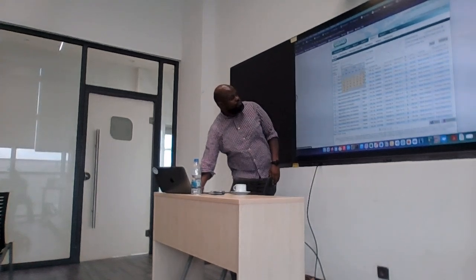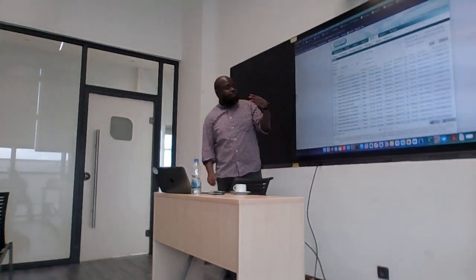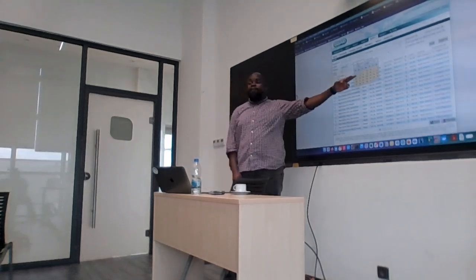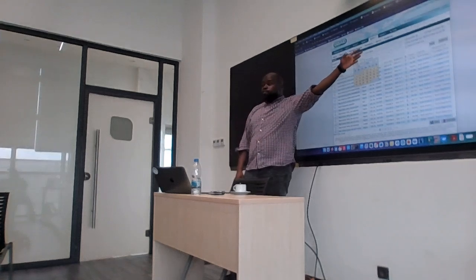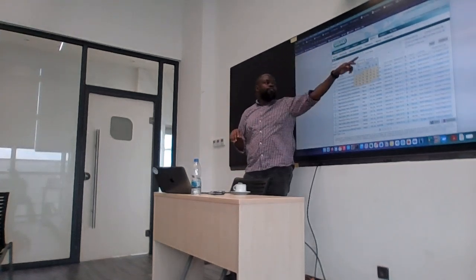So I'll just choose first, right? You don't even have to put the end date if you want everything after a given date, but you can also choose the end dates. Alternatively, you can also look for submission dates if that's what you want. Just remember that you understand what the difference between collection and submission is.